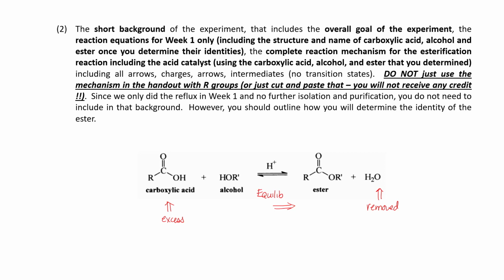Removing the water is a little bit more difficult. There's actually apparatus that can be used to remove the water as it's formed. If you're an overly ambitious go-getter student or have an interest in this, there is something called a Dean-Stark apparatus that you could use to remove the water as it's produced in the reaction and the reflux, and that would push the equilibrium to the right.